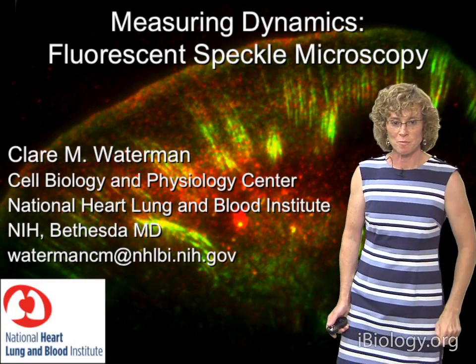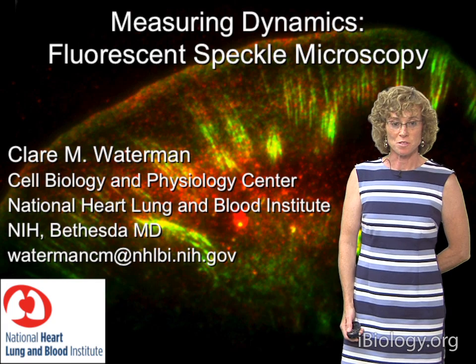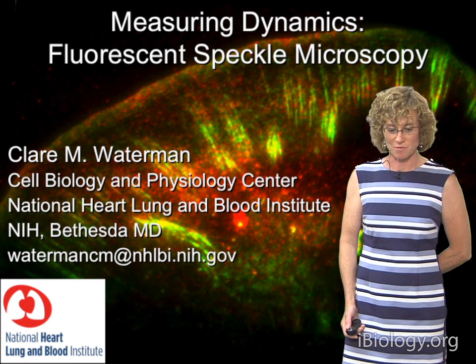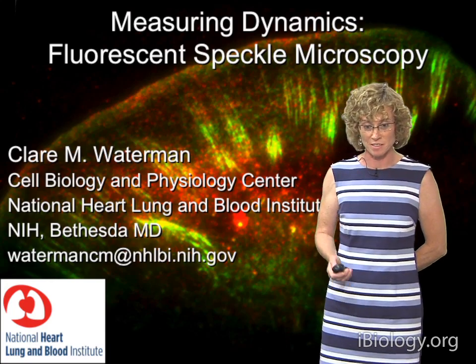Hi, I'm Clare Waterman from the NIH, and I'm going to talk to you today about fluorescent speckle microscopy, which is a method that I invented by accident when I was a postdoc with Ted Salmon back in the 1990s.